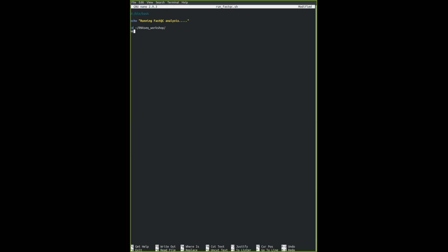We're going to create with mkdir an output directory in outputs. So I'm going to type it like this, followed by FastQC. Pay attention to the names that you provide to the directory. If it's all caps, make sure that you keep it with all caps when you specify it in the next part.